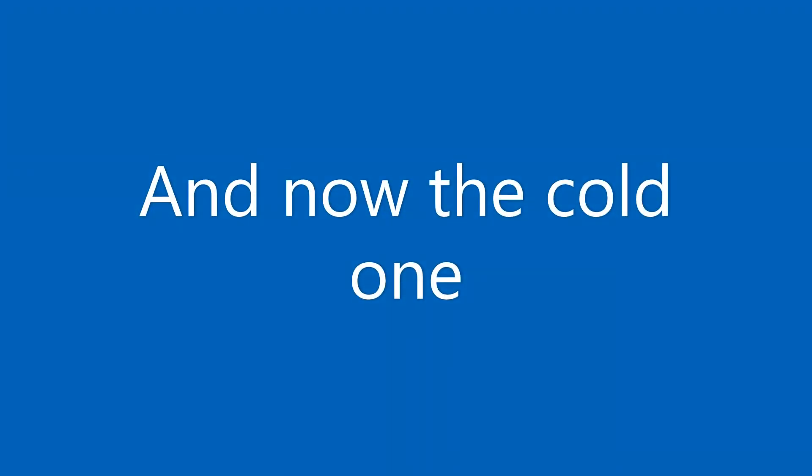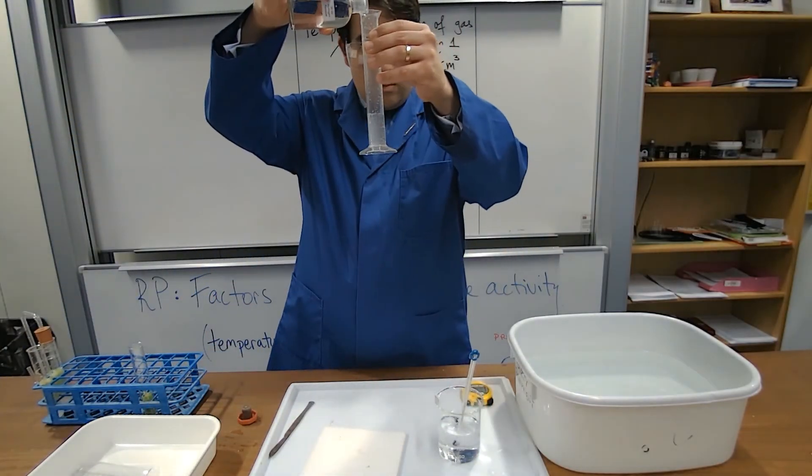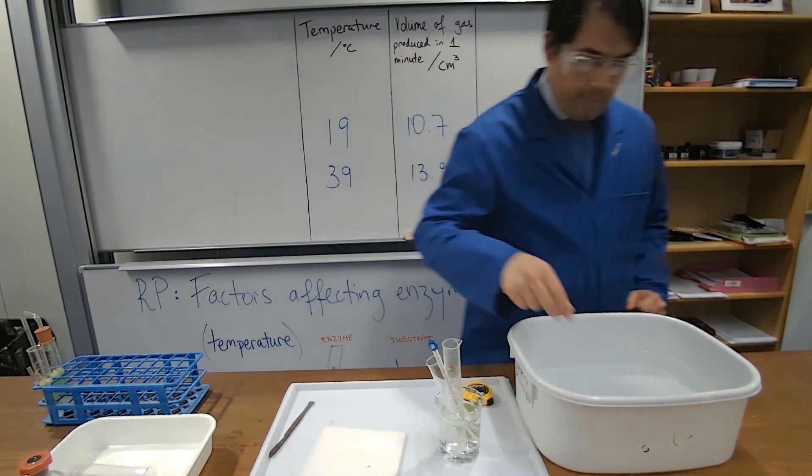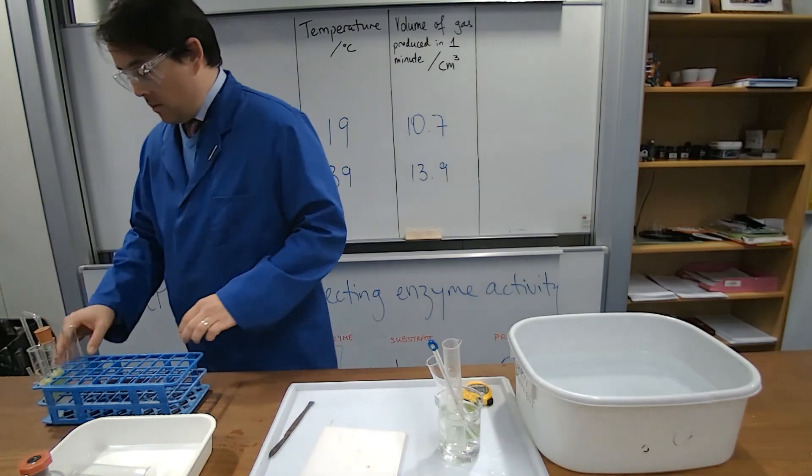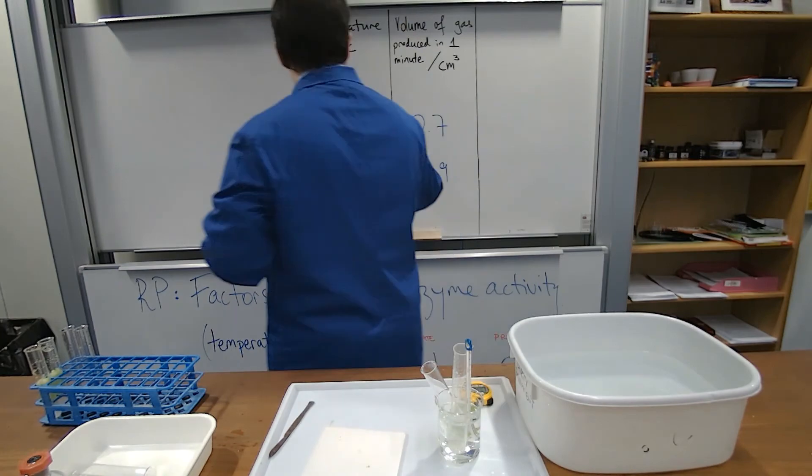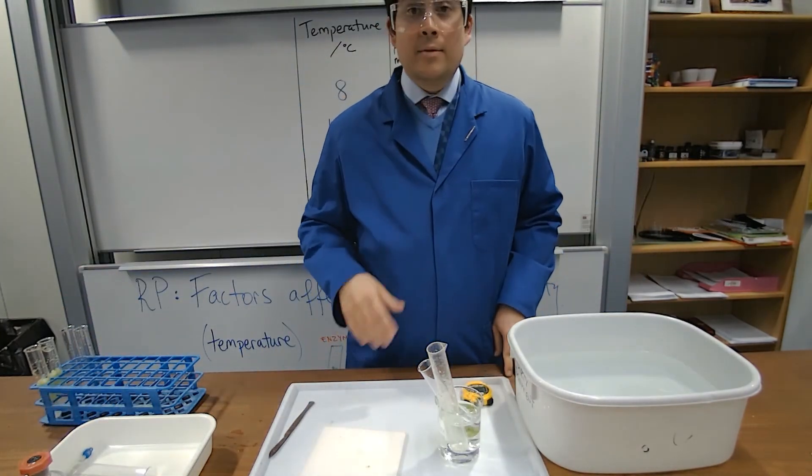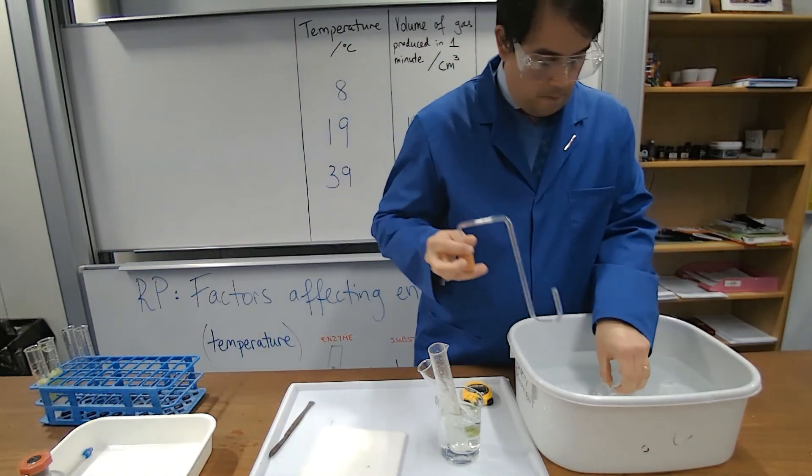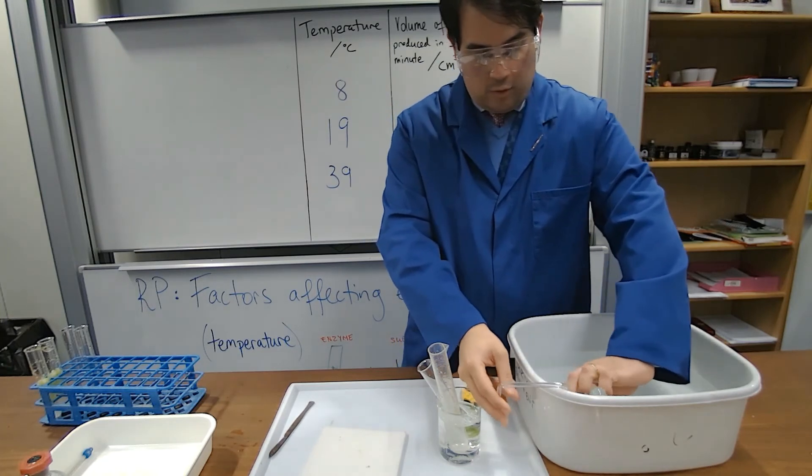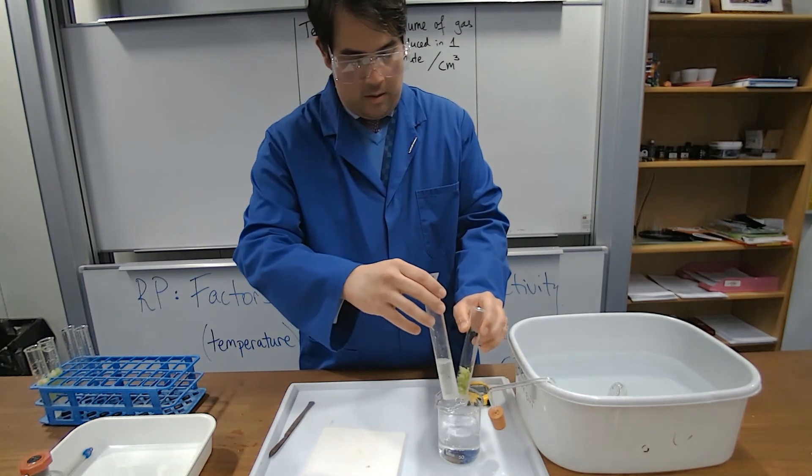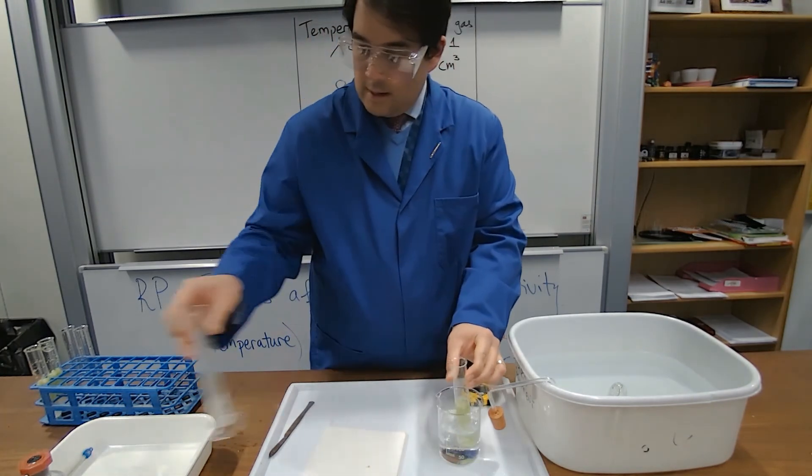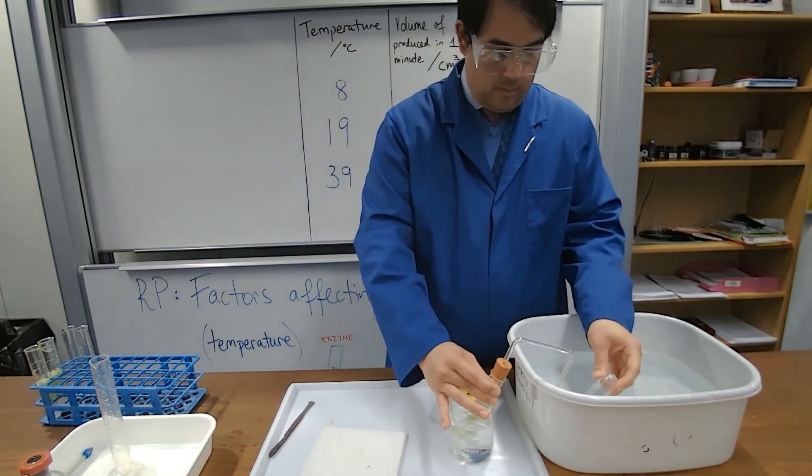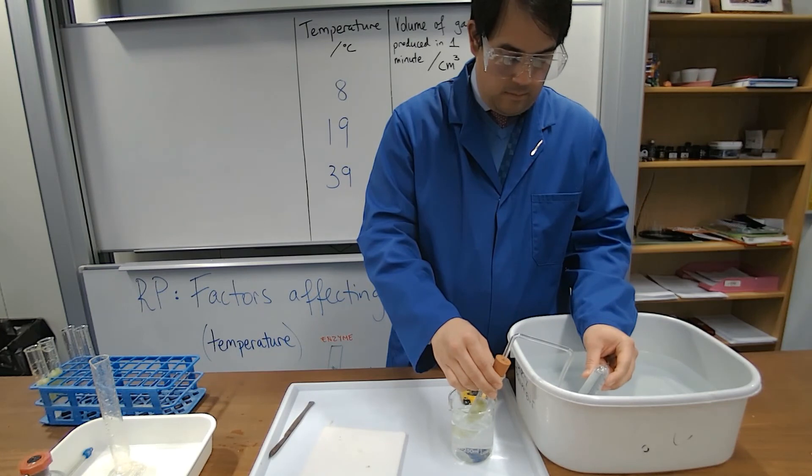Much quicker. A few minutes to acclimatize, and we'll see what the temperature drops to. So, this is from the cold water bath. Okay. So, we have our temperature of 8 degrees. Cold water bath. I have celery. I have hydrogen peroxide. Do the set up again. Water. U-tube. U-tube. Just in there like so. Now, mix the two straight on with that. Start the timer. And we wait.